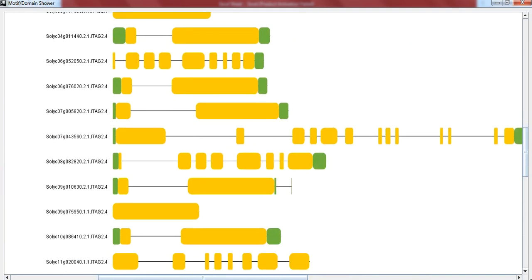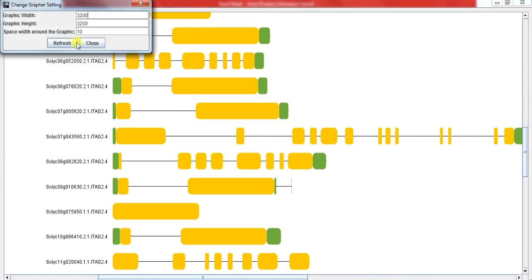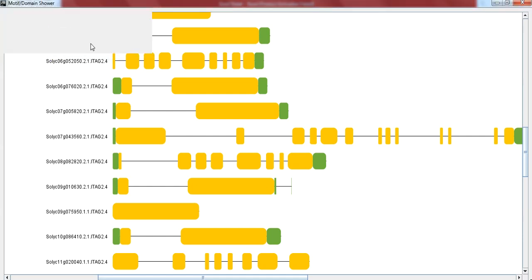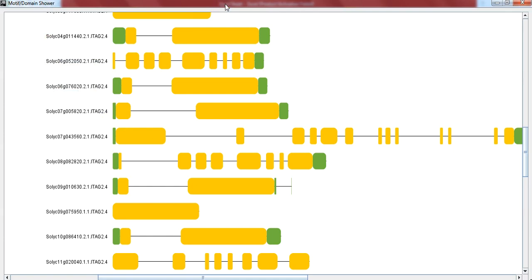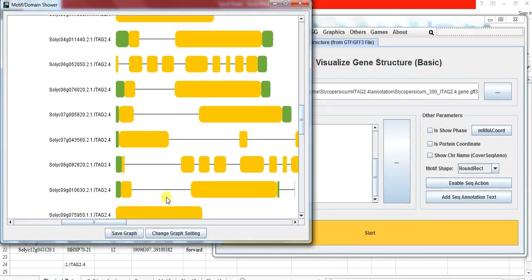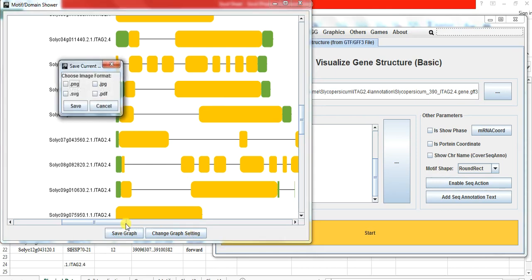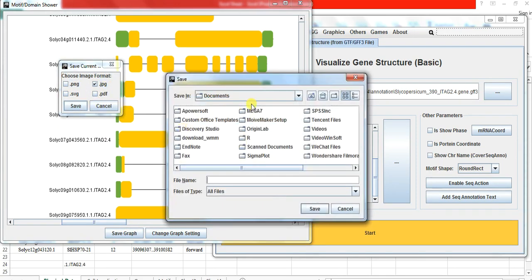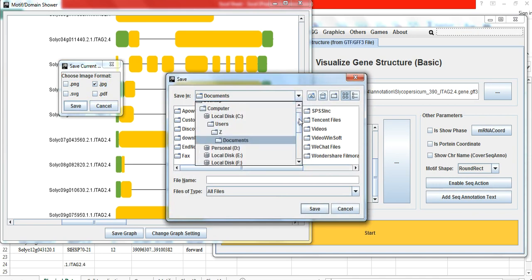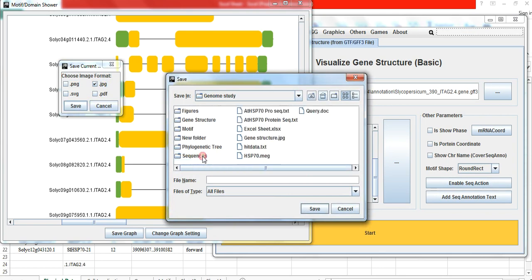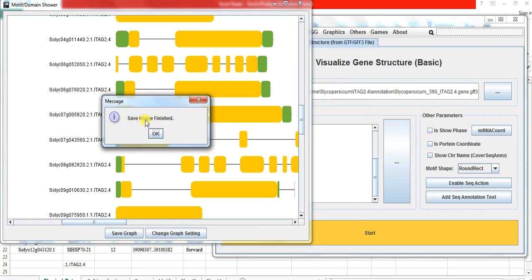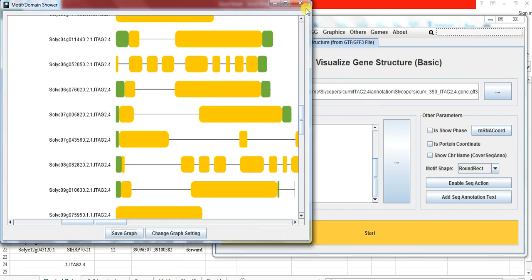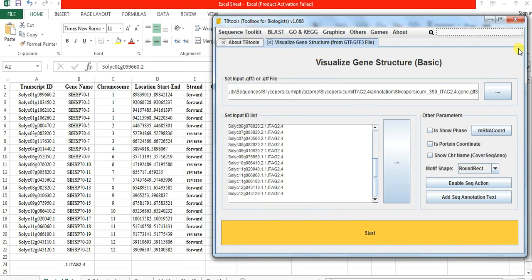Change graph setting: you can change the graph width, height, or space around this graph, then refresh and save graph. When you click on save graph, this window appears. These are the change graph settings and this is the save graph. So you can change in any format, JPEG, and save it into your destination folder that is present on desktop, that is Gene Structure, TB Tool. So save it.